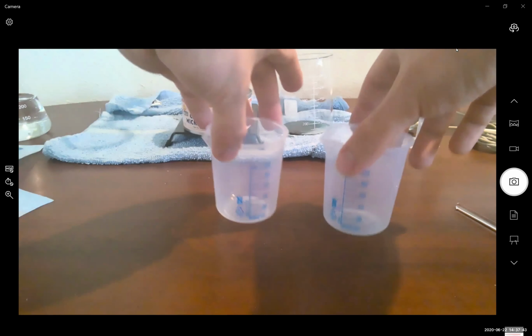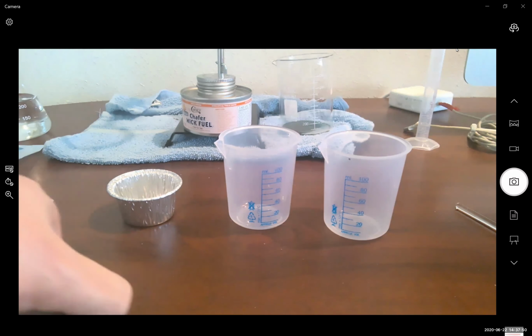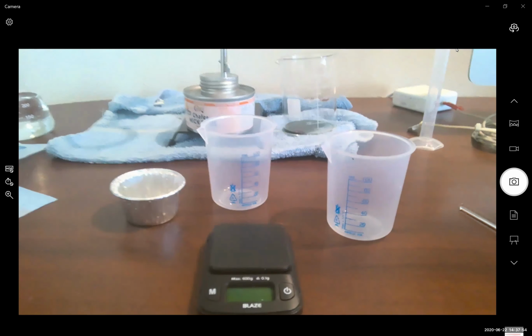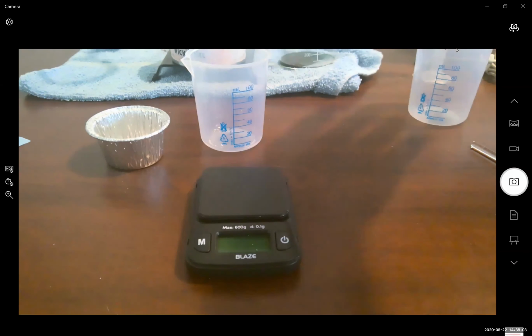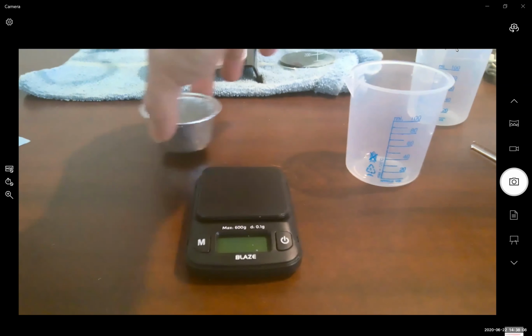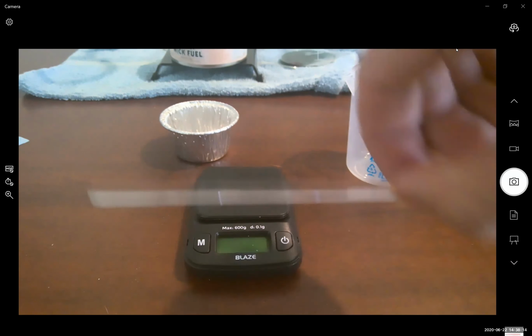So at this stage, we're going to need our 2 beakers and our aluminum cup, our scale, our deionized water. One of our beakers will be waste, the other will be for rinses, and then we'll have our aluminum cup. We'll also need our forceps and our stirring rod.